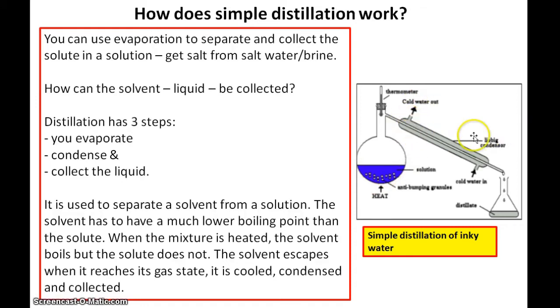You need to run cold water in to speed up the process of condensation, which is turning water vapor into liquid water.